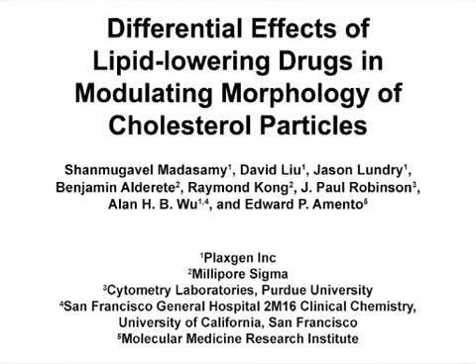The overall goal of this study is to evaluate the effect of lipid-lowering drugs in modulating morphological features of cholesterol particles using a plaque array method, and to identify potential biomarkers for diagnosis of atherosclerosis and determining drug effects.